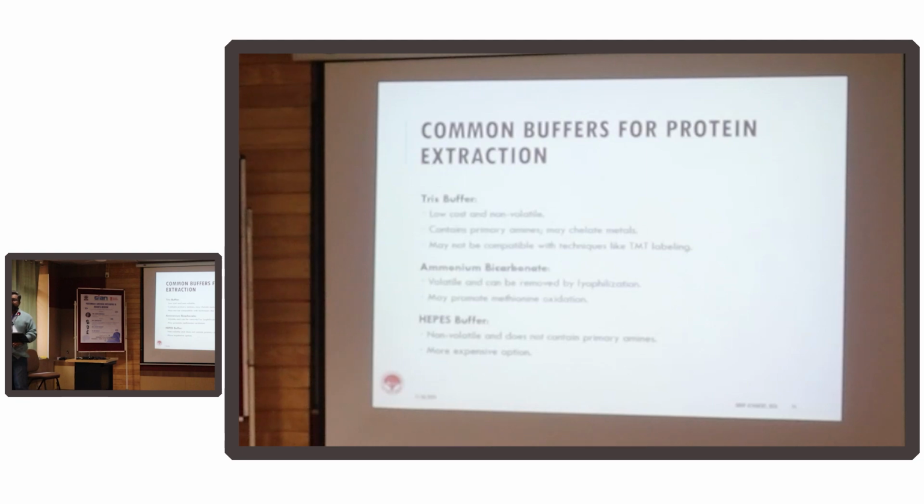that can... there are methods by which you can do proteomics. One is the labeling method, and sometimes TMT labeling won't work. So again, always try to remember what is the downstream method that you are going to follow. Are you going to label your proteins? Read up.